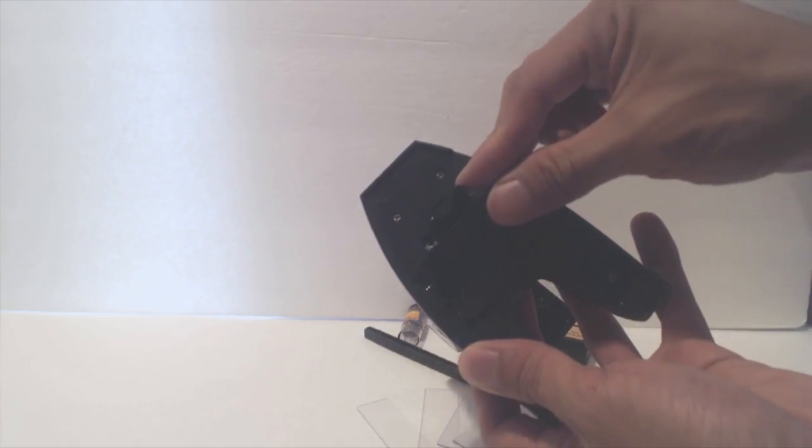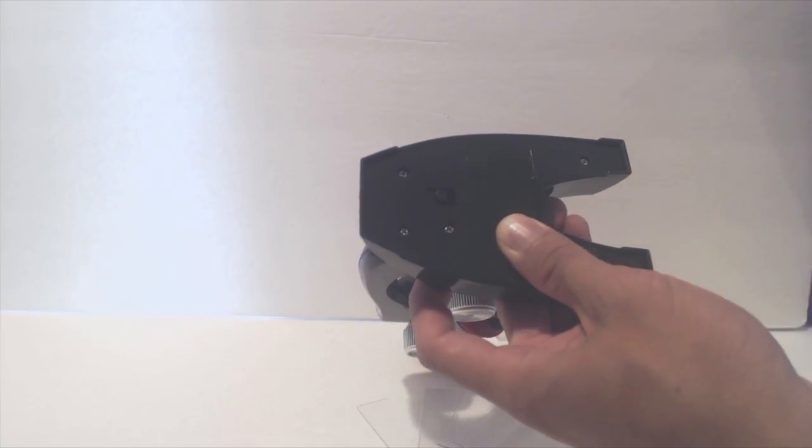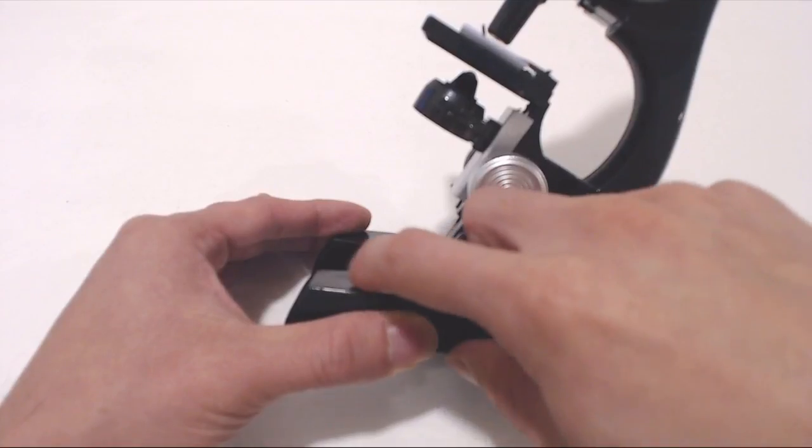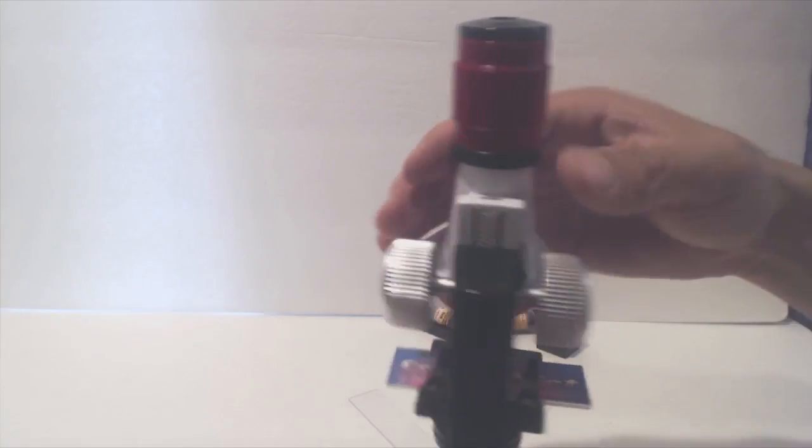The battery bay door has a mini screw that keeps it on, but it's not really required if you find it to be a nuisance. Turn on the light by using this little red switch on the base. Let's take a look at the demo slide and see what it looks like.